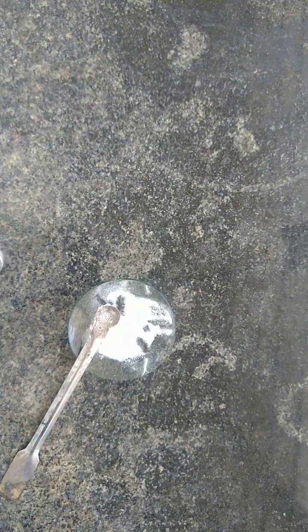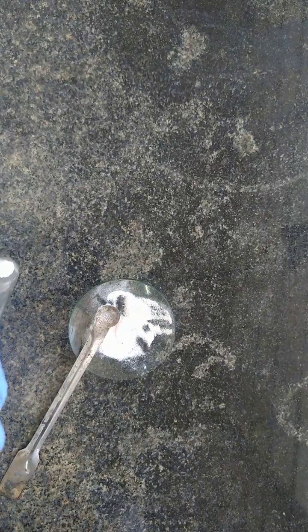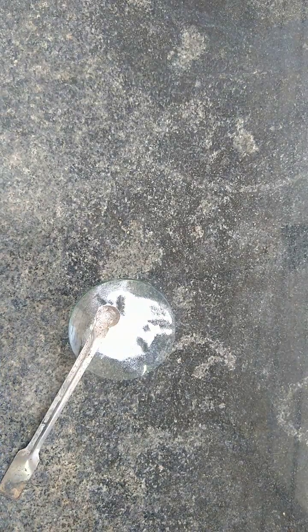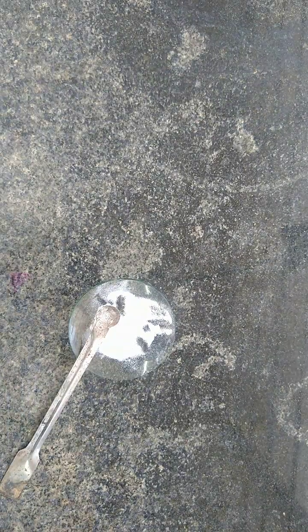To this I am going to add sodium hydroxide solution, NaOH, and this I am going to boil now. Yes, after boiling I am not getting any pungent smell of ammonia, which will give the inference that zero group is absent.